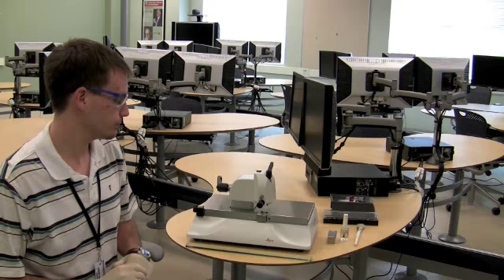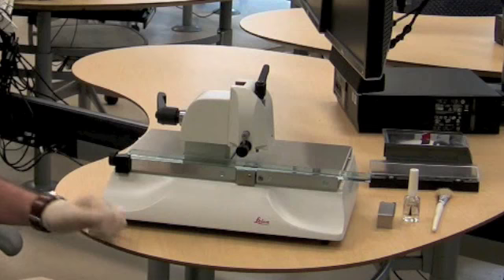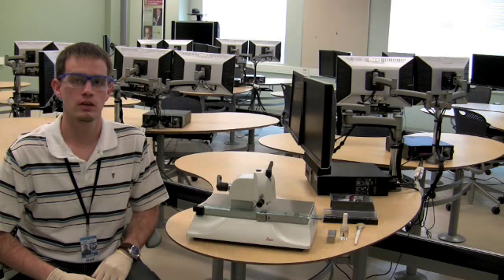What we'll do is take our 400 millimeter piece of glass and place it on the instrument. Once we do that, we'll take our rotatable knob located on the left side of the instrument and turn it towards us. What this does is lock the piece of glass into place, and it also makes sure that it is horizontal to the plane. At this point, we're ready to perform our first break.